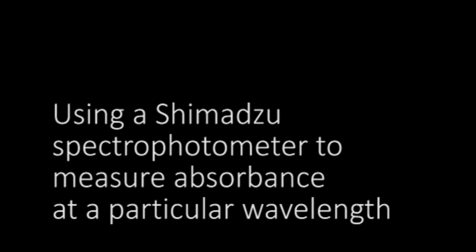This brief video demonstrates how to use the Shimadzu UV mini spectrophotometer to measure the absorbance of a solution at a particular wavelength.